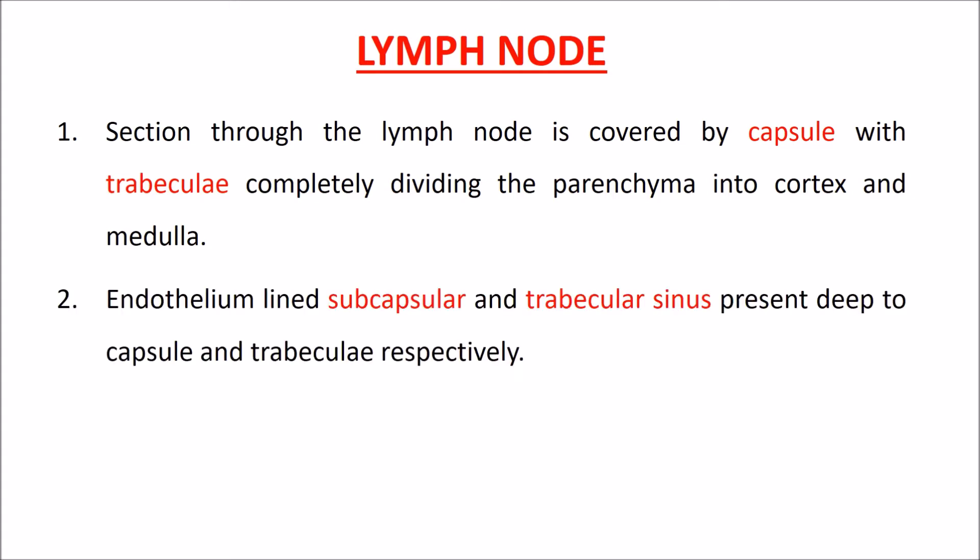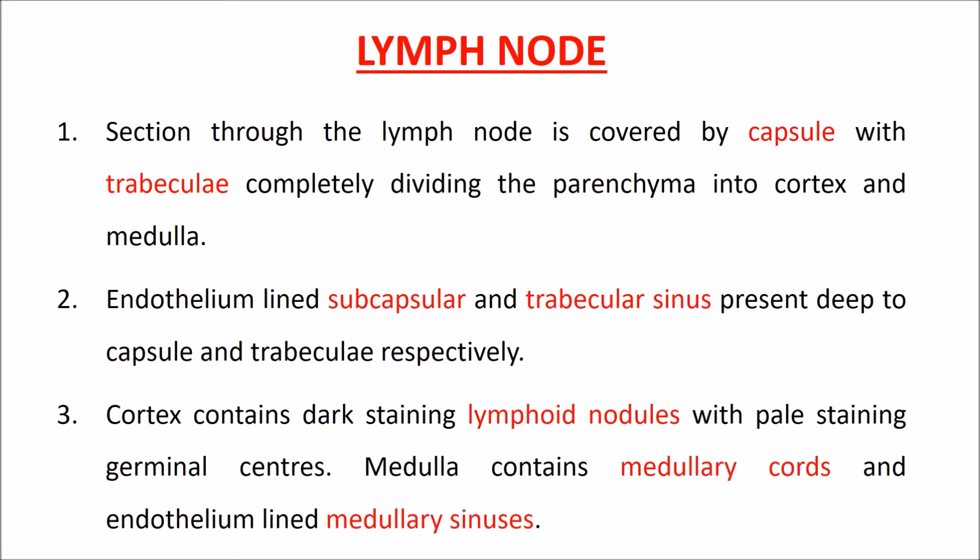Endothelium-lined subcapsular and trabecular sinuses are present deep to the capsule and trabeculae respectively. The cortex contains dark-staining lymphoid nodules with pale-staining germinal centers.